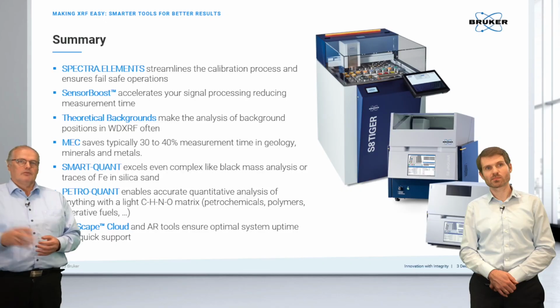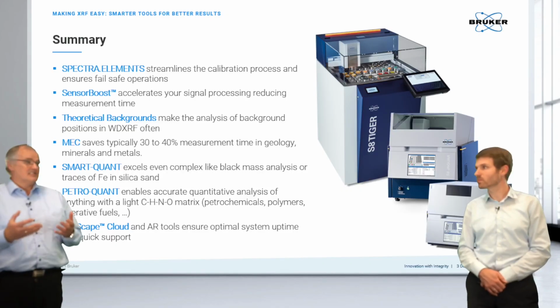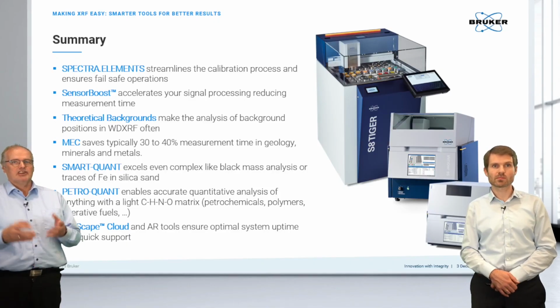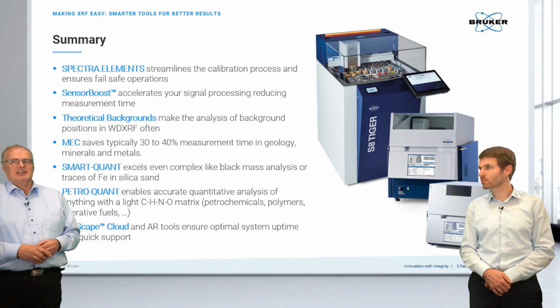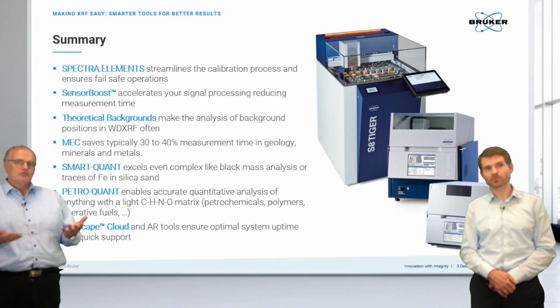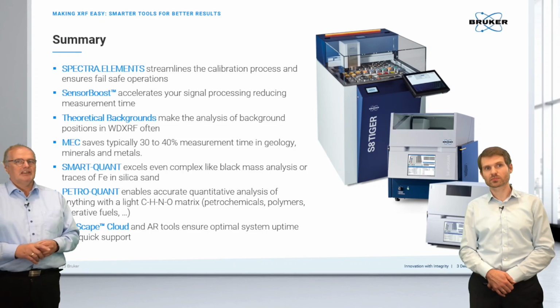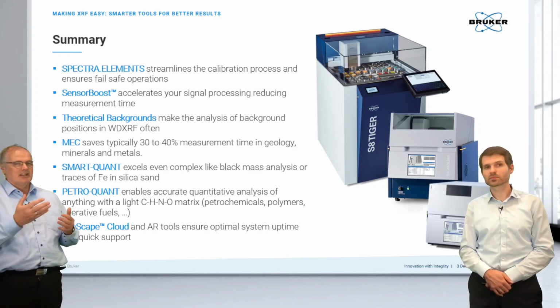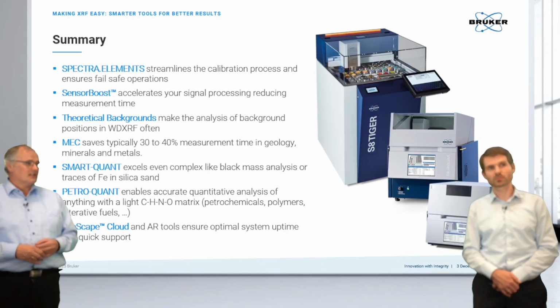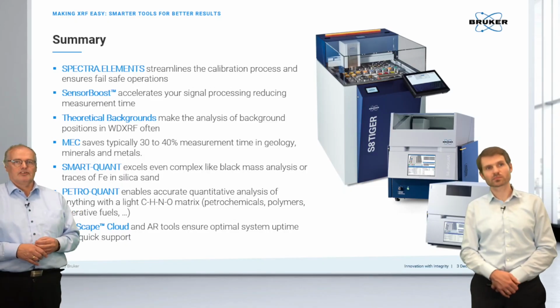And then we have learned from Adrian that SMART-QUANT excels in a lot of complicated applications meanwhile, especially when we don't have any standard materials available to set up calibrations. And solutions we are providing, like the PetroQuant, is something in between, still a very flexible tool like the standardless software, and it's standardless for the user.